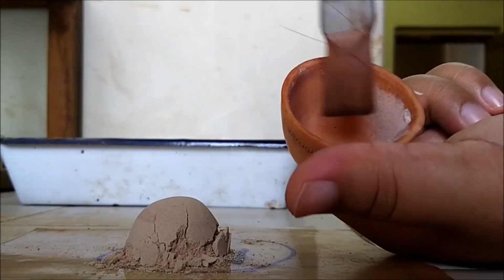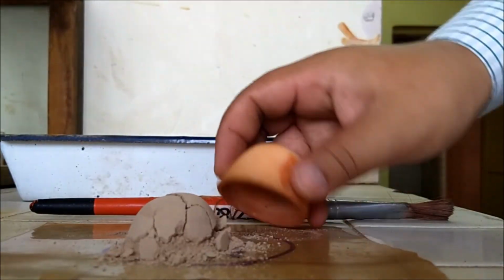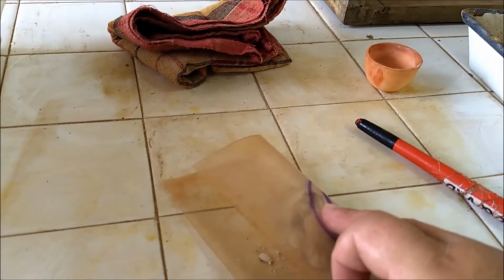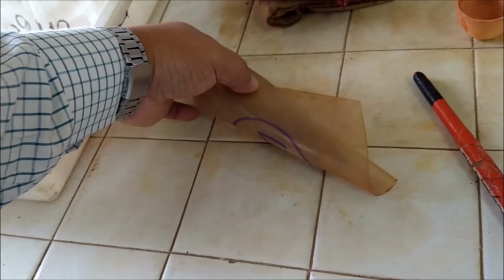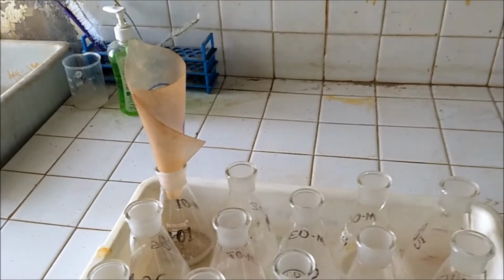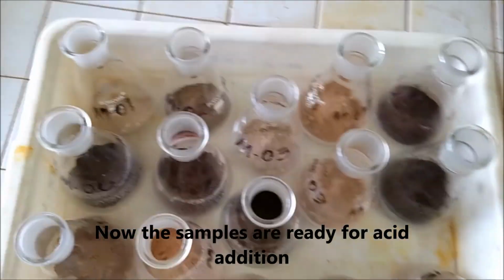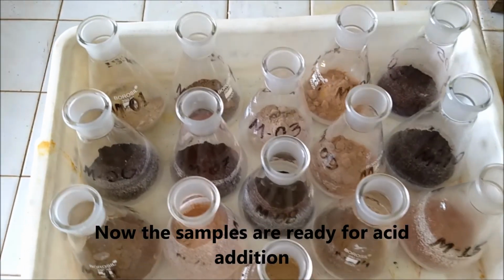It is mandatory to clean it properly, otherwise, who knows, your gold particle is stuck on the wall of the crucible. Now roll it and put it serially in the concerned conical flask, like this. Now you can see that this is transferred in the conical flask very nicely, and these all are transferred to the conical flask.